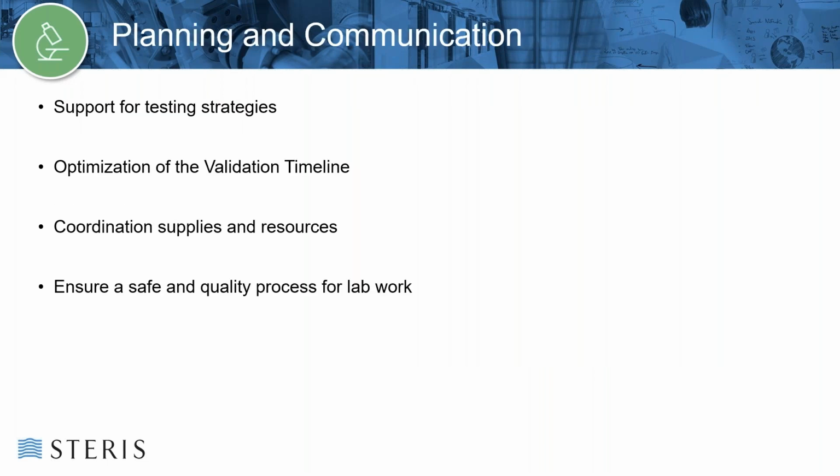In general, when approaching sterilization validation of single-use systems, it's important to plan and communicate with the test laboratory to ensure that a strategy is developed for the bioburden and sterility test.